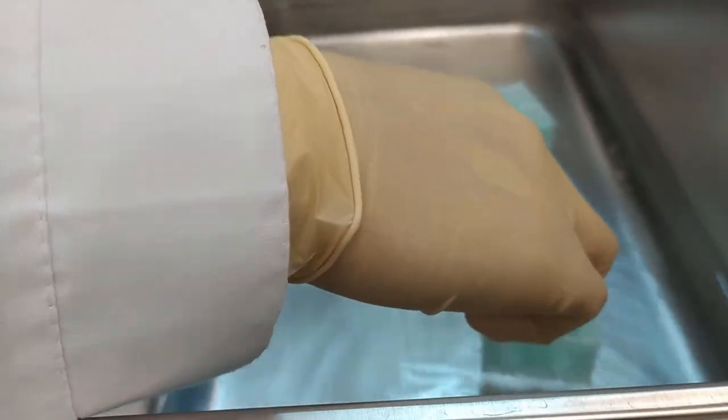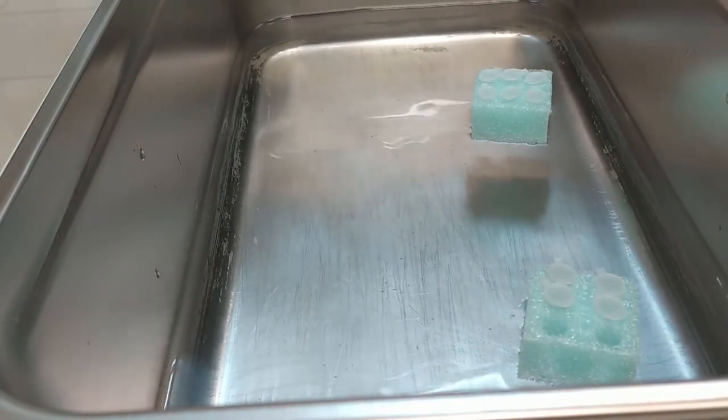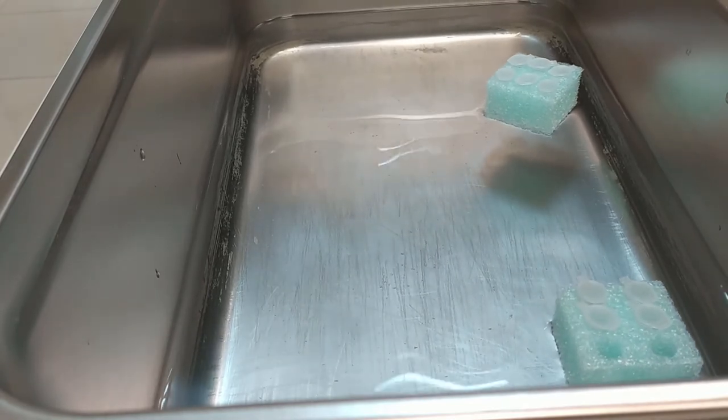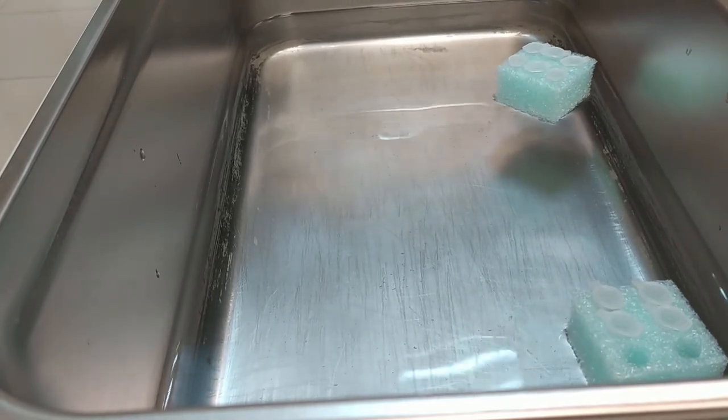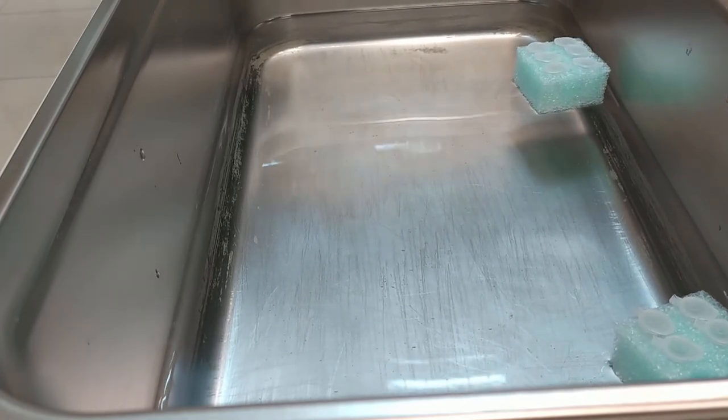We leave it for 45 minutes, and after that time we stop the reaction and place these samples into the fridge to start with the gel electrophoresis afterwards.